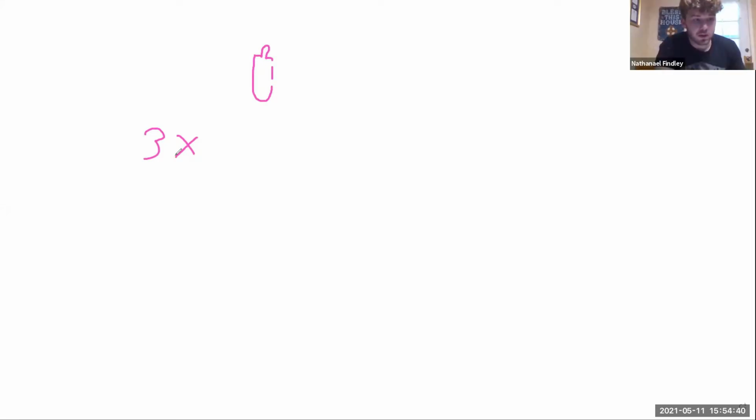Do I put the pH tester in there or something? Yep, you want to use the pH tester to see what the pH of your solution is, because it should technically be neutral if it's been neutralized. So I want to put it in the actual fluid, not the foam? Well, the foam is better, because some of the fluid is going to have a lot more color to it, and that changes the pH reading.